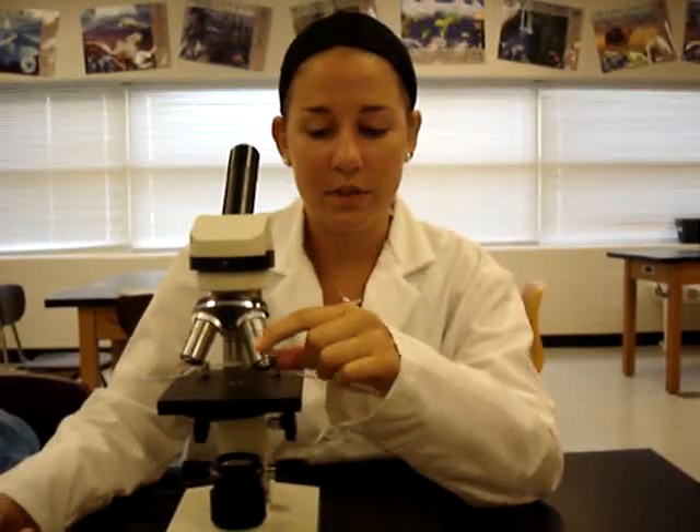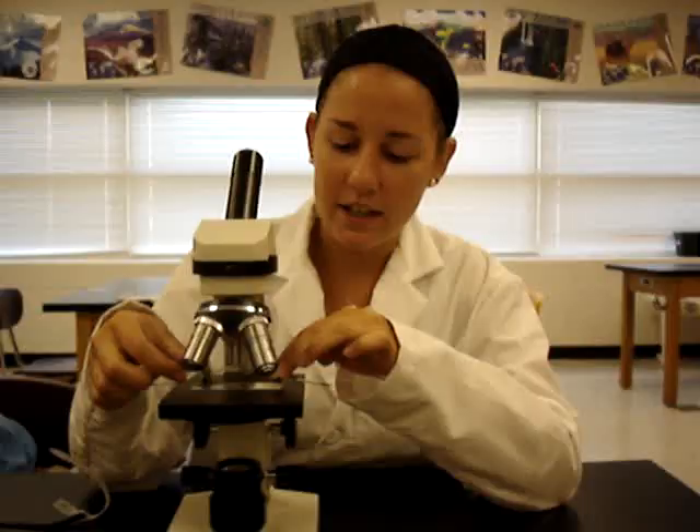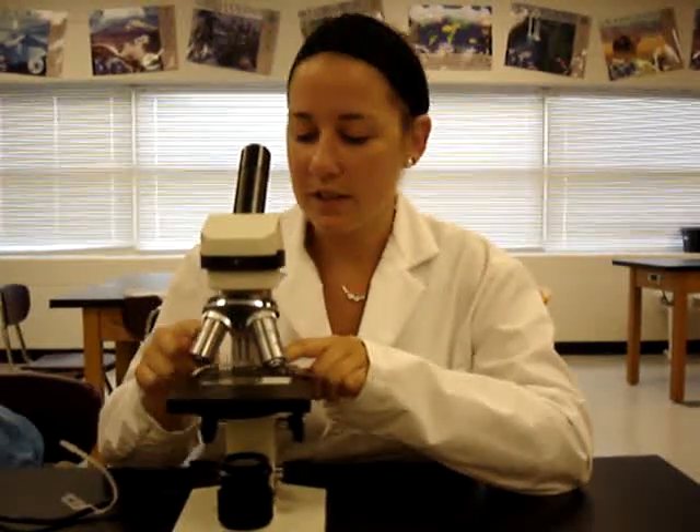Always make sure the microscope is on low power first, which is usually the one with the red stripe. Next, place the slide on the stage and clamp it down so it doesn't go anywhere.